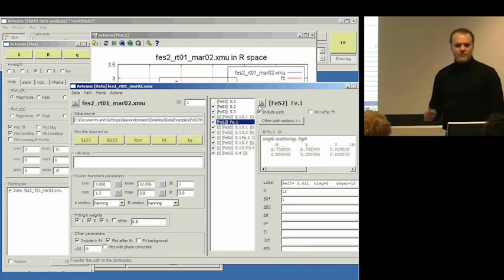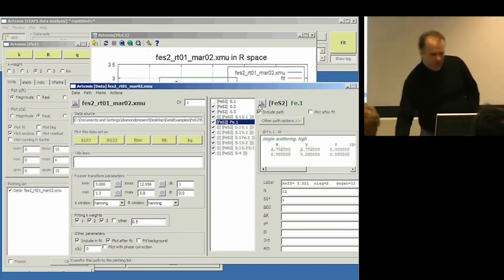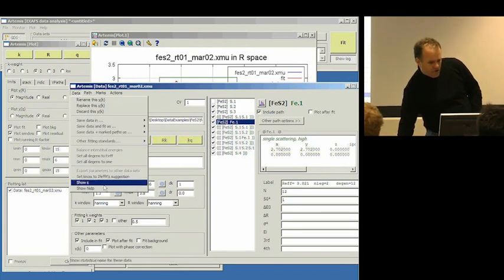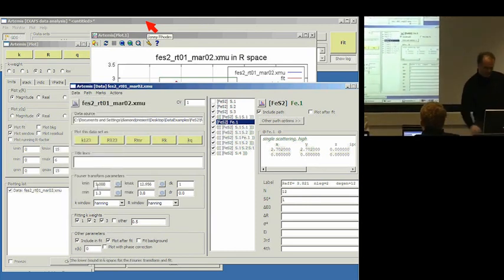And now we have a problem, or we appear to have a problem. So, first off, I want to use the values of the Fourier transform range and the fitting range to evaluate the number of independent points in the data. And the number of independent points in the data is about 15.